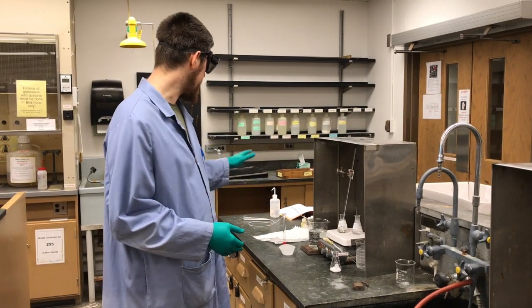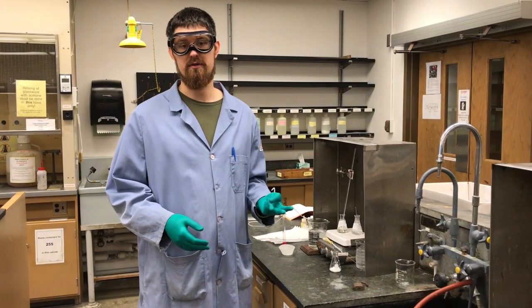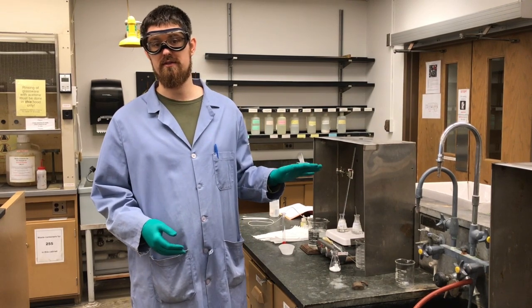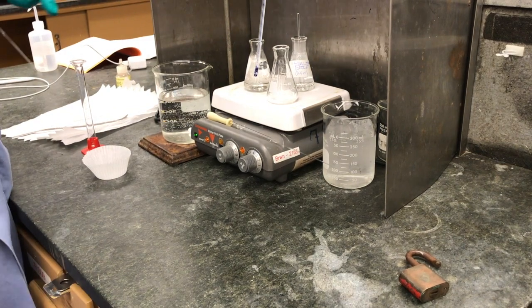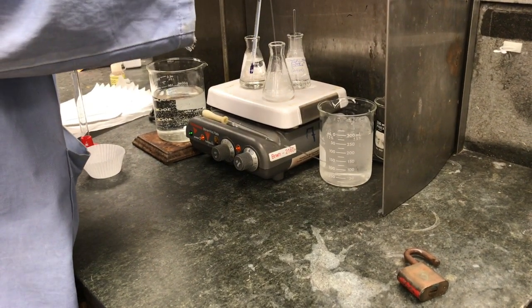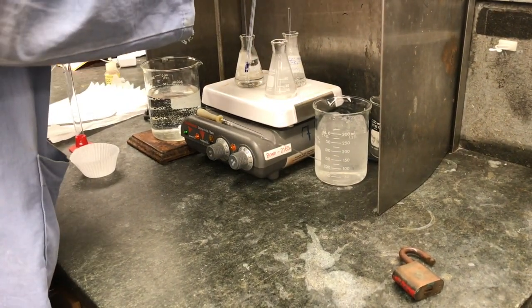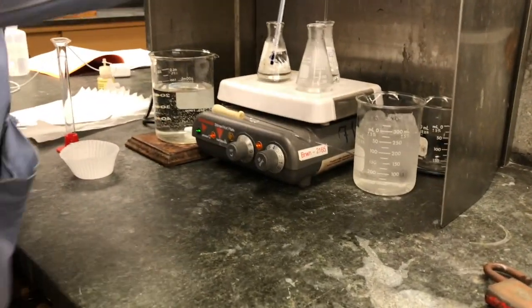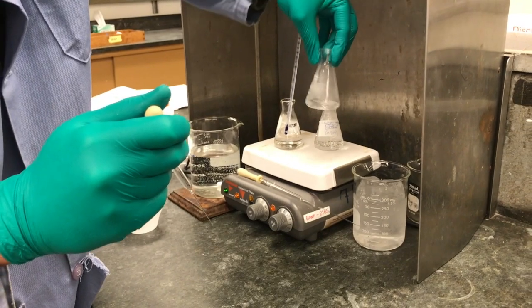And based on what the lab manual has told us, it'll take about twice as much water to ethanol. So we're going to want to make sure that we keep track of how much volume we use for each of these two solutions. So we're starting with about 50 milliliters of ethanol. That'll make it easy to tell. And, but it's got most of it. Okay, so we're starting to get most of it dissolved.